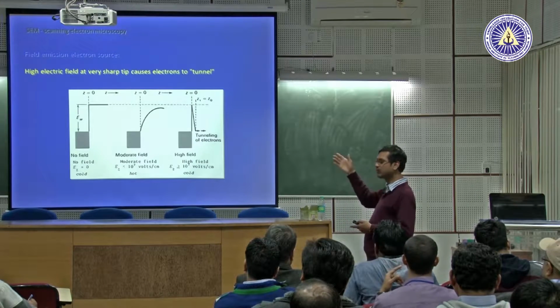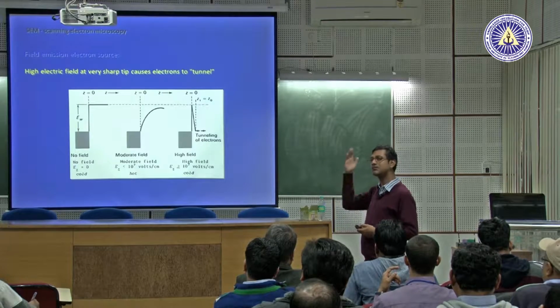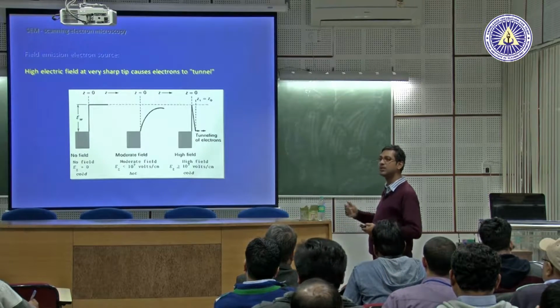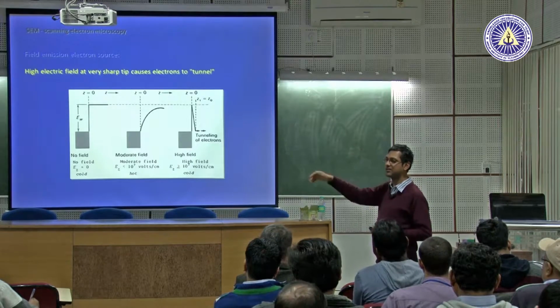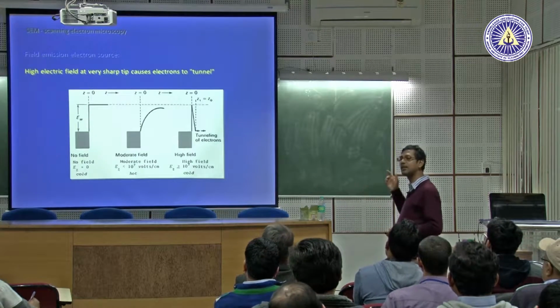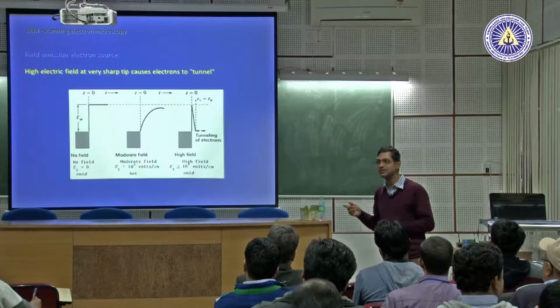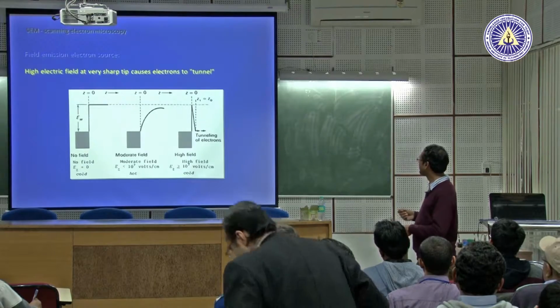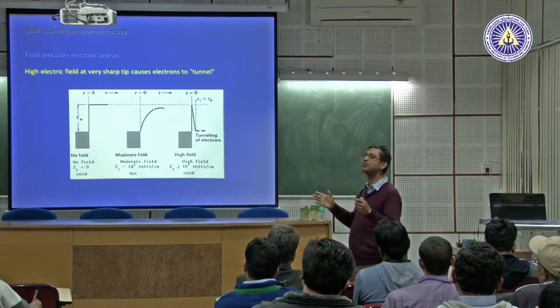Chromatic aberration in light is the same as this one, because light has different wavelengths from red to green, so you have aberrations in the lens. The same thing happens in the tungsten filament, but here electrons are tunneling through a barrier and you are applying a huge field, so the energy width of the electrons coming out will be very small.